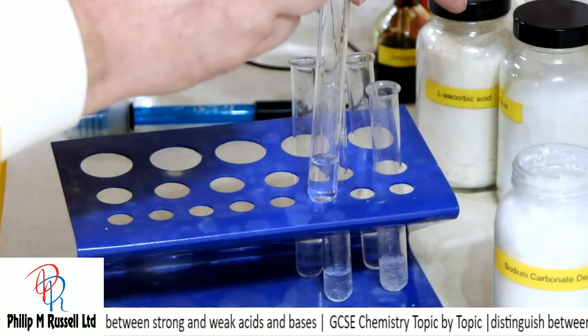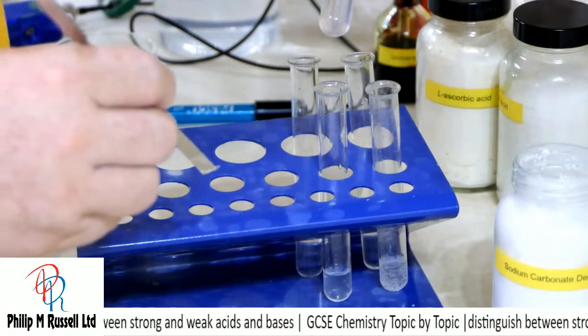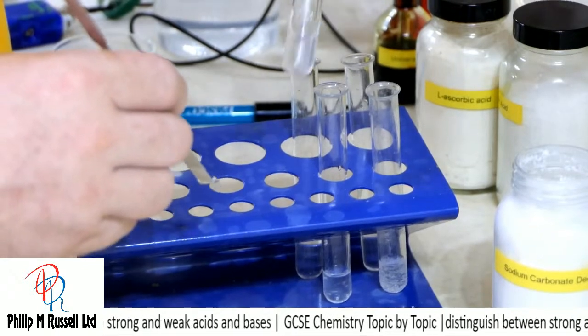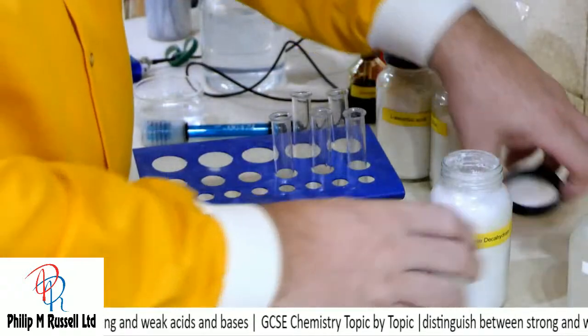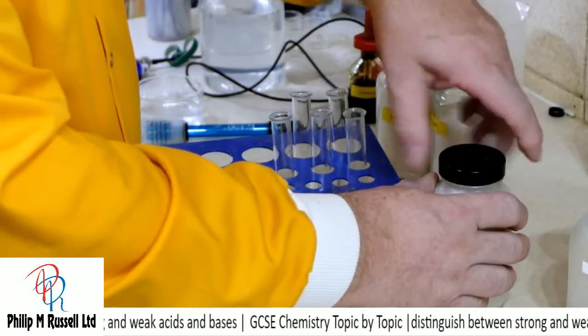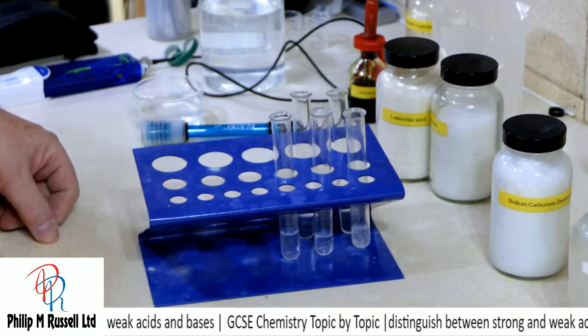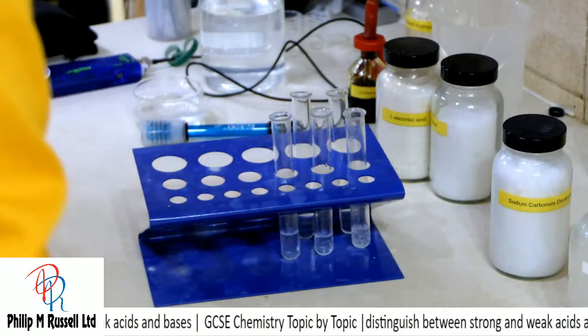Now 100 times. And barely anything happening there. We could go on and dilute more and more and more until basically nothing happens. And let's see why that might be true.